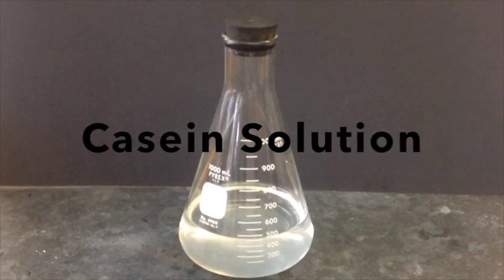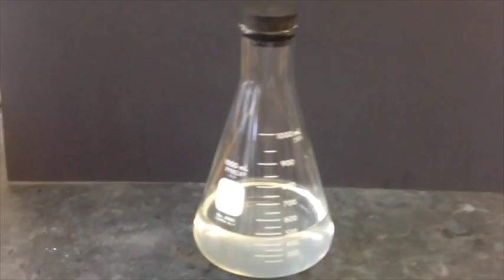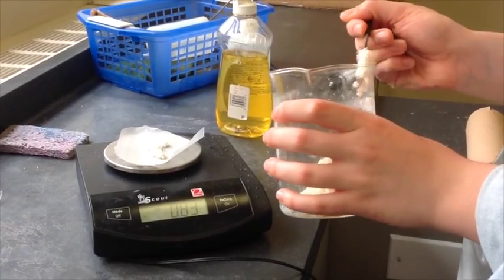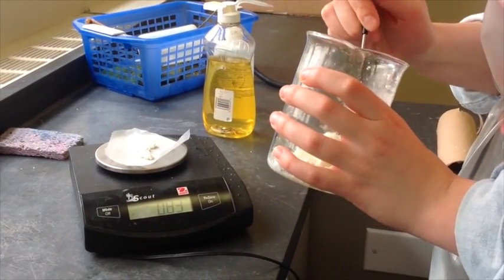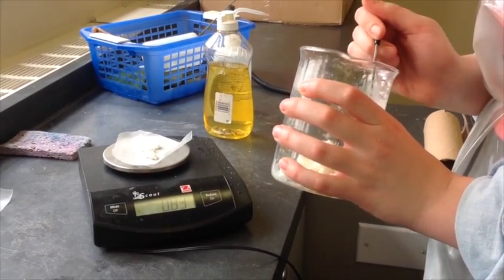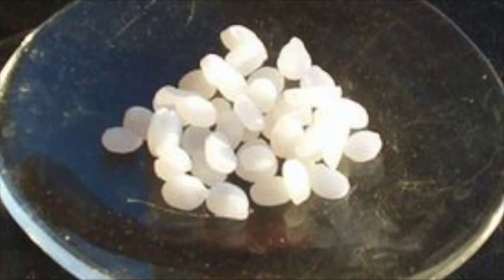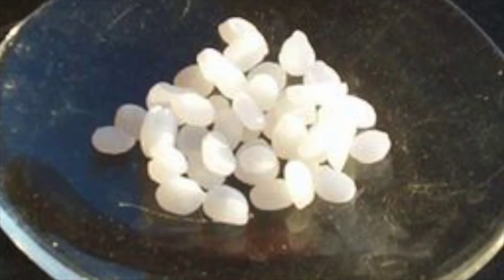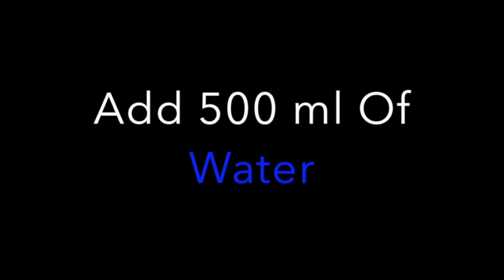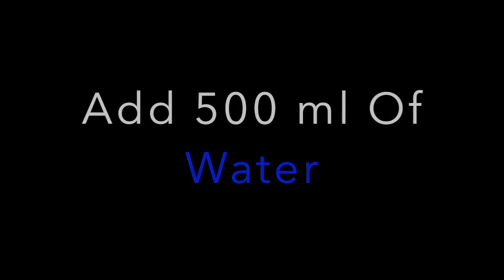Now I am going to make a casein solution from the casein I have just extracted. Step 1: You are going to weigh out 2.5 grams of the casein solid. Also measure out 2.5 grams of NaOH solid. Measure out 500 milliliters of water and add it to a flask. Now combine the NaOH, the water, and the casein solid in the flask.